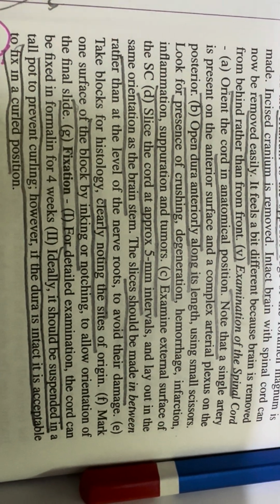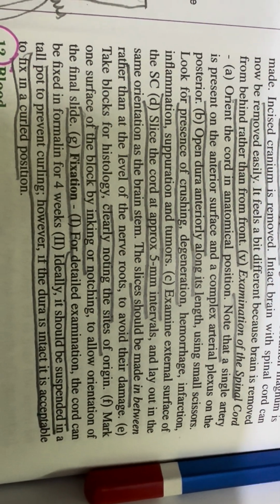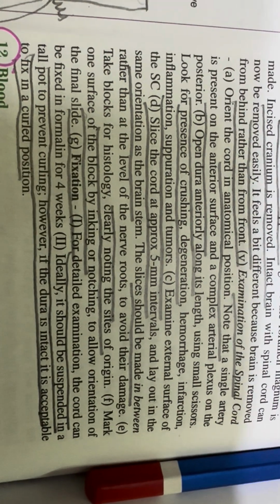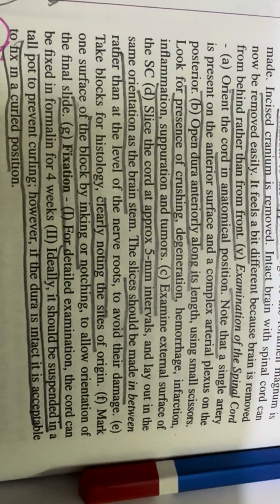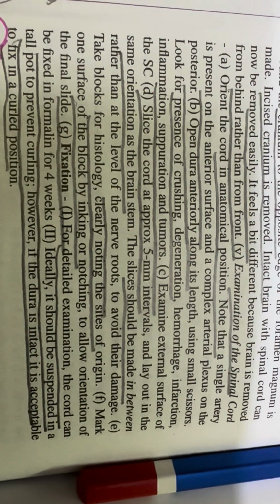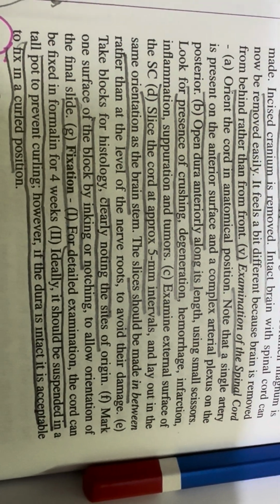Slice the cord at approximately 5 mm intervals and lay out in the same orientation as the brainstem. The slices should be made in between rather than at the level of the nerves to avoid their damage. Take blocks for histology, clearly noting the sites of origin. Mark one surface of the block by inking or notching to allow orientation of the final slide.